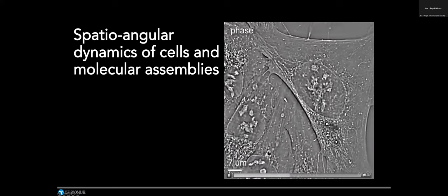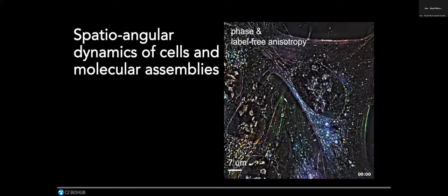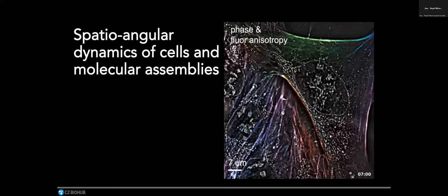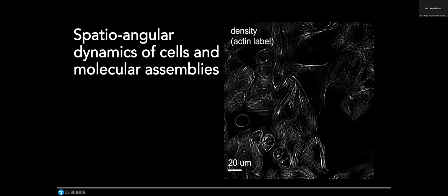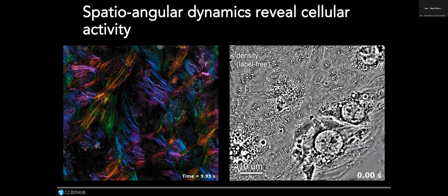And we can do that over time. We can do this in a time-resolved fashion. So by combining the parallel detection with four cameras and really driving the microscope really fast, we are able to make these measurements. And these open up some really exciting possibilities for the field of mechanobiology. In many cases, when you are trying to measure the mechanical properties of biological systems, you want time-resolved measurements of the density and the anisotropy of the structures.